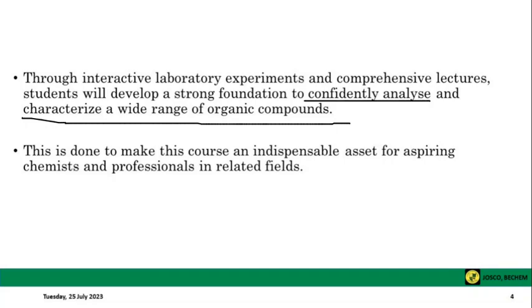That is, if you are given a set of samples containing various organic compounds, you should be able to identify the organic compounds that are present, whatever the analyte is, if it is an alkene or an alcohol. By giving you the basics in analysis, or identifying organic compounds, you should be able to identify any of them when given a sample.